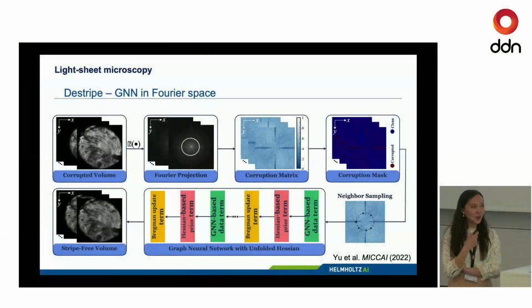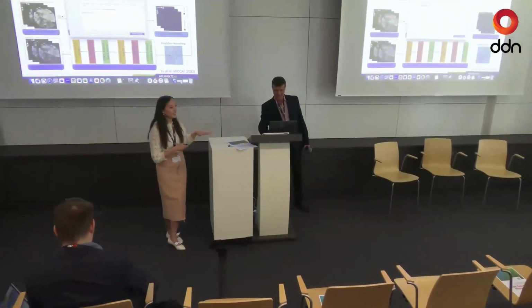Another question we also asked Jan is whether only your light sheet has these stripes and another light sheet does not. I have to admit, on some light sheets I don't see the stripes because they use a different algorithm and different hardware settings. Jan's microscope has these stripes, but Ali's microscope also has these stripes. Because it's tissue absorption, it's really quite common.